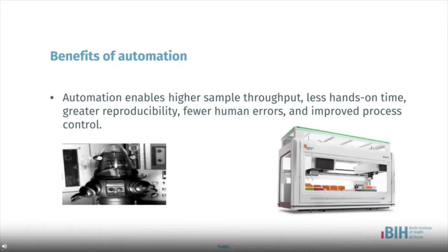A way towards standardization of workflows utilizing molecular assays is their automation using liquid handling stations. Automation not only enables greater reproducibility, eliminating human errors and improving process control, but also enables higher sample throughput.